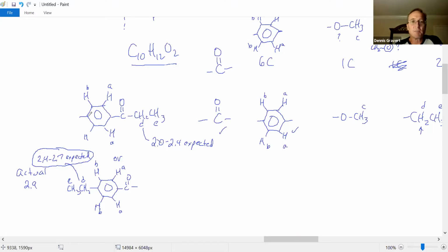What's left to complete the molecule? Well, I already put the ethyl group on there. So now I need this ether group. So this is really close to the answer, maybe a half, maybe 1 point away. I would give someone full credit. Hey, that's not an ether, that's an ester. Oh, and assign the peaks. So this is peak C. Someone said, I'm going to choose this molecule. Well, that's pretty darn close. I'm saying it's probably this one.